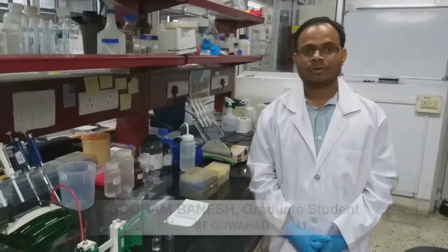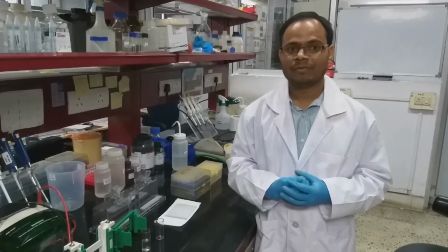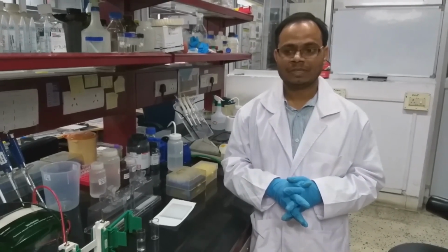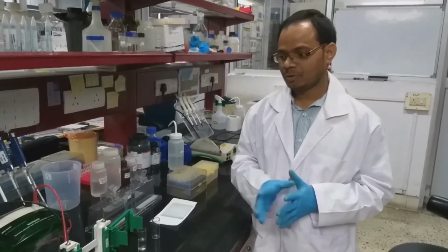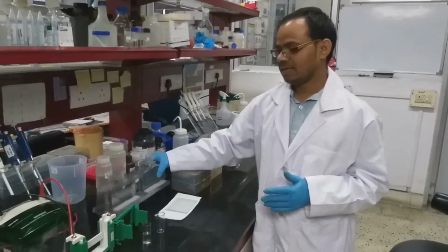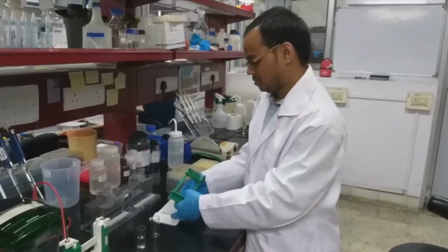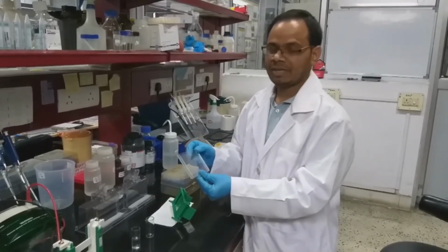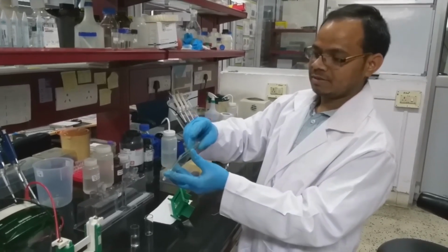In this video, we will demonstrate how to run an SDS based gel, how to prepare various reagents required for running an SDS based gel, and what different instruments we can use. So here, this is the gel casting stand, where we can use these glass plates to prepare the gel. In between there is a space where we can pour our gel solution.